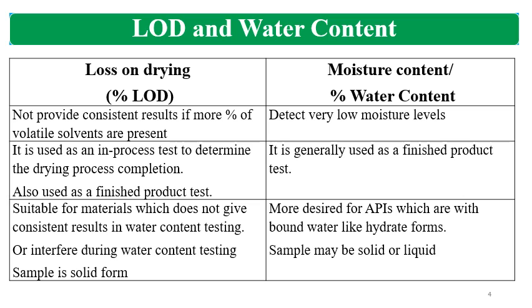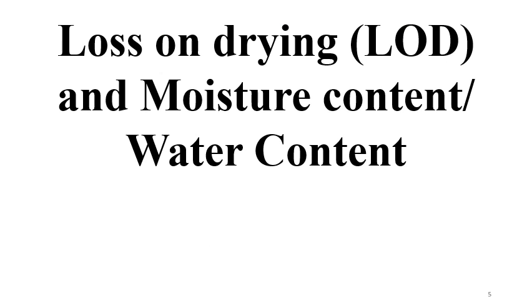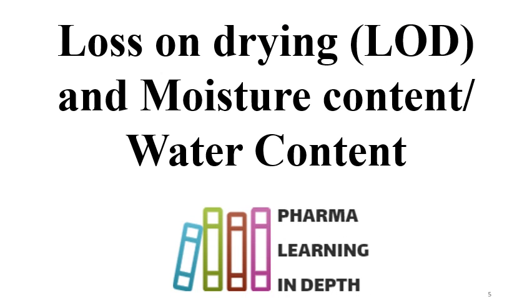So these are the basic differences between loss on drying, that is LOD, which is expressed as percent LOD, and moisture content or water content, which is expressed as percent water content.